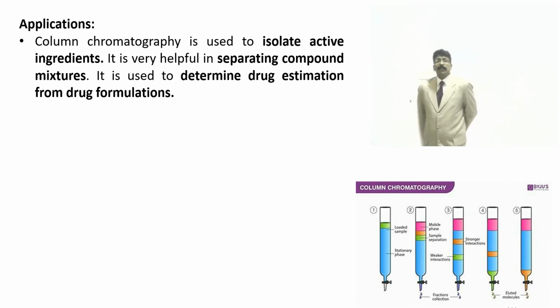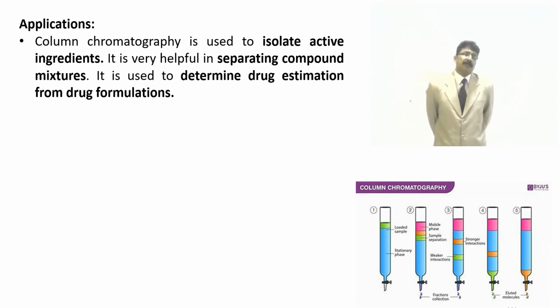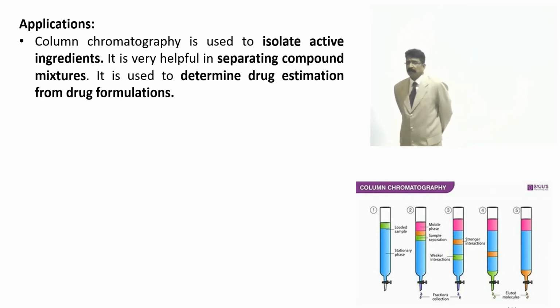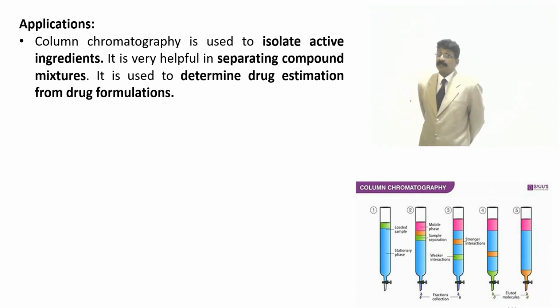Anyhow, it was very interesting for the separation of compounds. Very interesting. Even a burette can be used. Even the column I ordered was in the lab. It was in our store. The column is available. It is brought after giving an order of the size and everything.